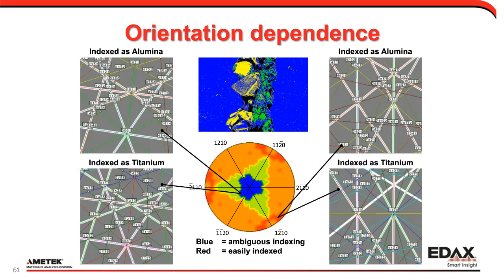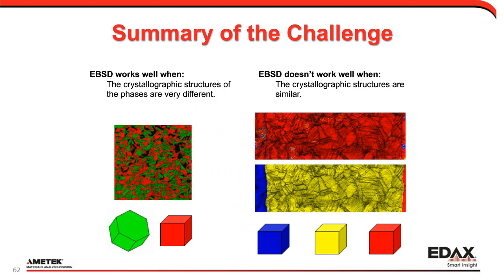And we just found this one serendipitously. But what we can do is to say we know that EBSD works well when the crystal structures are different, and we've seen EBSD doesn't work well when the crystal structures are similar or they produce similar looking structures.